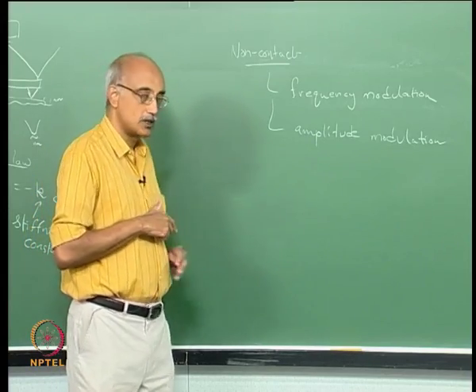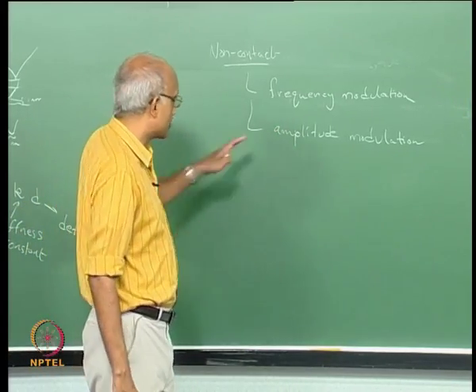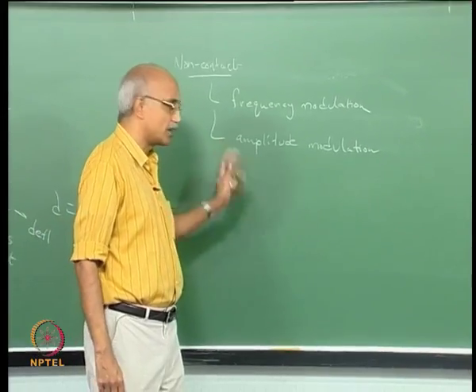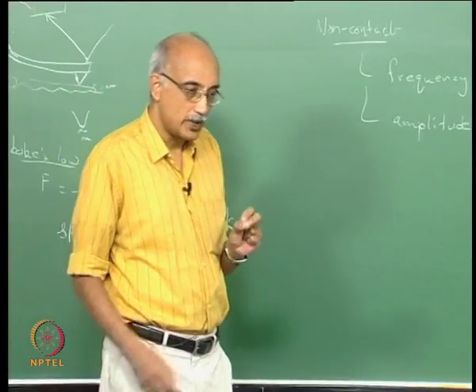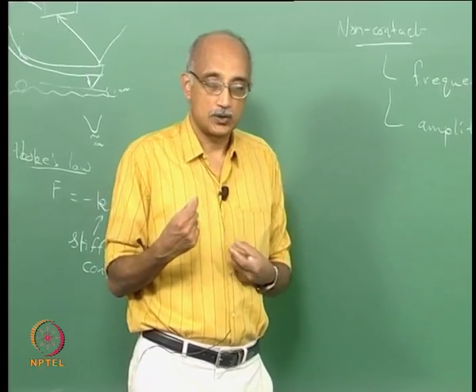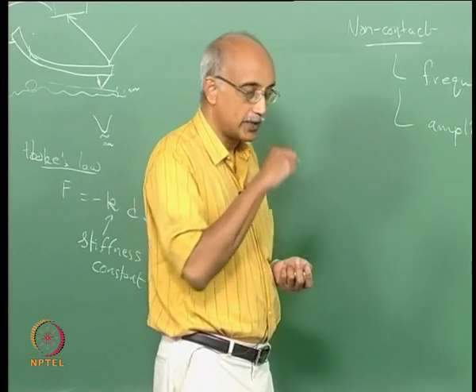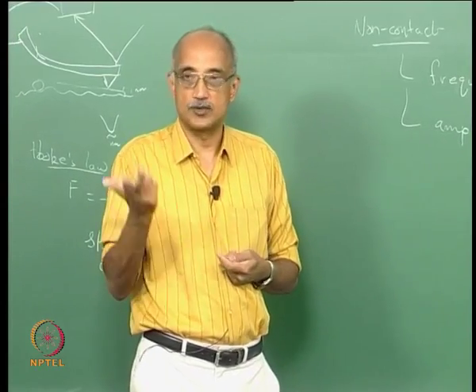And so these two techniques are widely used. The frequency modulation technique is more sensitive and is mostly resorted to. Amplitude modulation is used in certain special cases. One of the risks with this non-contact mode operation is that there are situations where something called snap-in can happen because it's an attractive force. So if you're not careful, the probe will suddenly slam against the surface. This can happen when, for example, there are severe gradients in either composition or in the roughness profile.